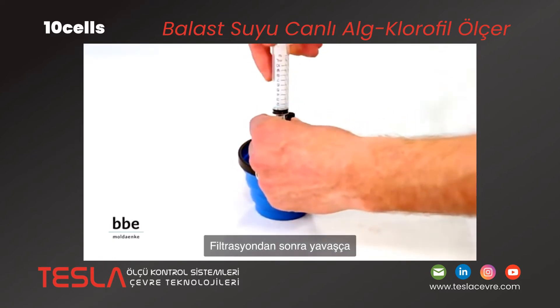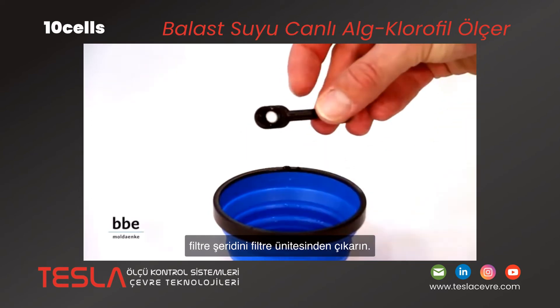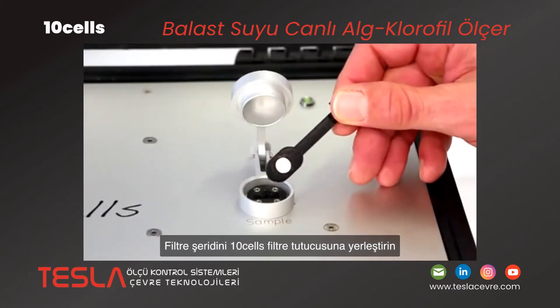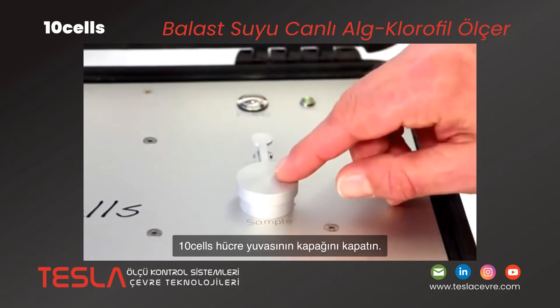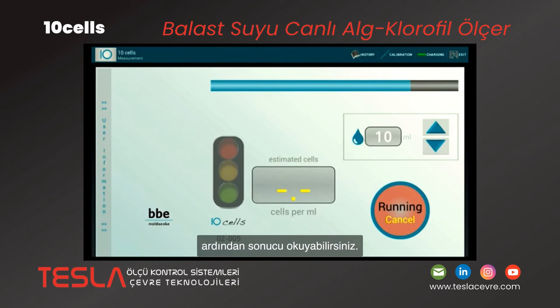After filtration, take the filter strip out of the filter unit. Here you see the TenCells device. Insert the filter strip into the filter holder of the TenCells. Close the cap of the slot and start the measurement by pressing the start button on the display. The measurement needs approximately one minute. Then you can read the result.